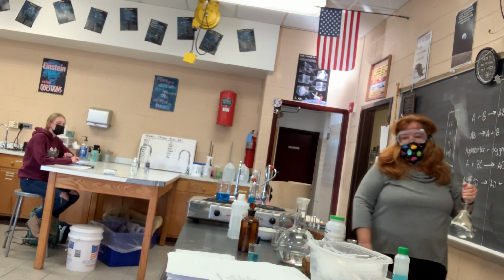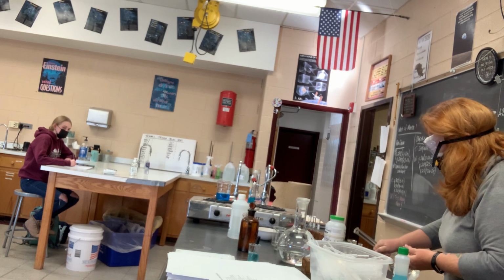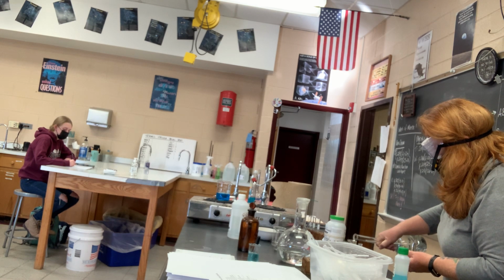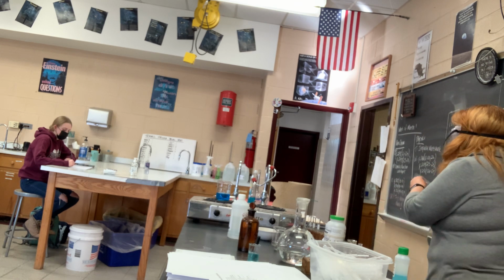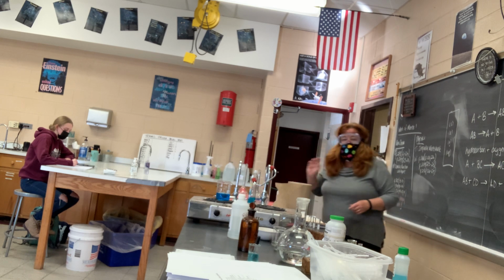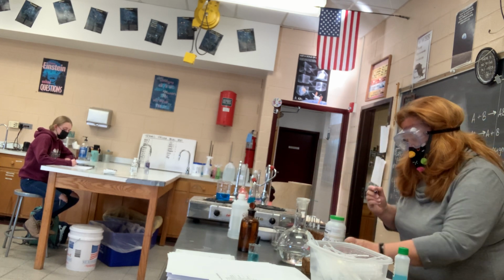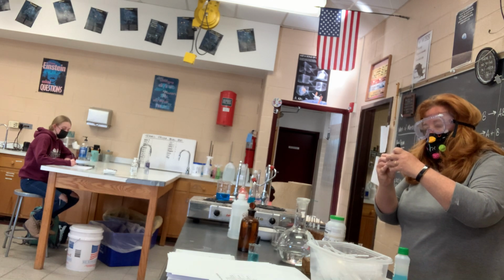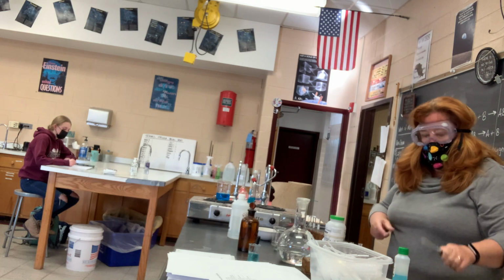Sodium hydroxide is also a clear liquid. This is going to be a double replacement. So you've got sodium hydroxide, a clear liquid, and copper sulfate, a blue liquid.